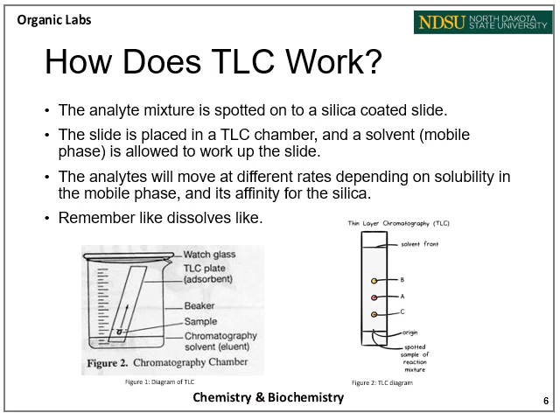Next, let's get back to TLC and how it actually works. The first thing you're going to do is spot your analyte onto your TLC slide. If you have a solid, you're going to have to dissolve it in some sort of solvent. If you have a liquid, you're going to have to dilute it to make sure it's not too concentrated.